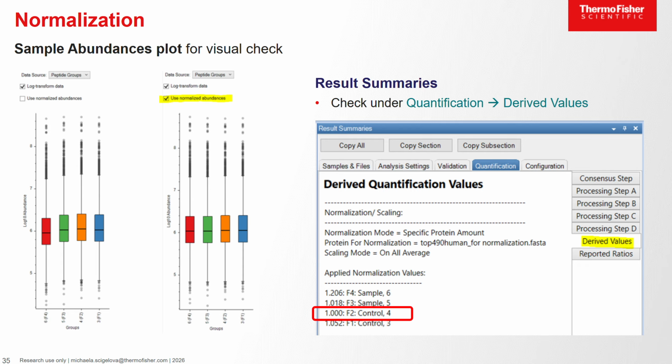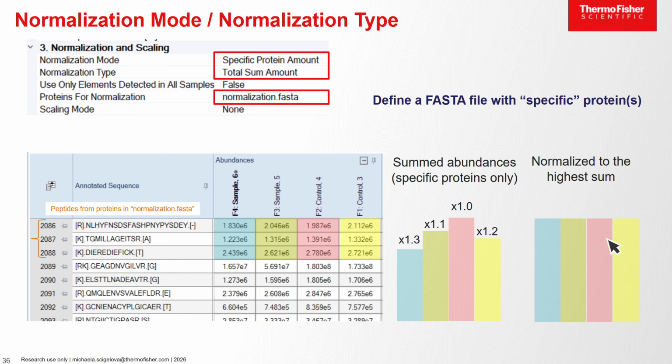If you are a bit more lenient, up to factor 3 would be acceptable. For label-free quantitation, because we have more issues with missing values, the data are not so clean as with the TMT, I would perhaps say up to factor 5. But definitely be careful when it goes over. Those quantitations might not be reliable.